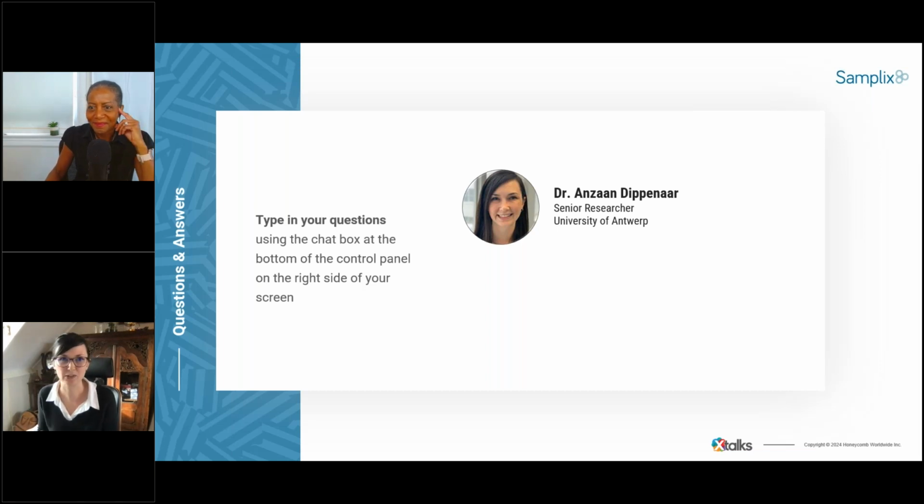That's quite a technical question, and I don't know if I'm technically adept to answer that. But as I understand, the droplets are very small, and in that dispersion, 95% of the material is dispersed in single droplets, and each is encapsulated by an oil emulsion, and that then ensures that there's only one molecule per droplet. Okay, all right. Thank you for attempting to answer that. And I think they're happy with that answer too.